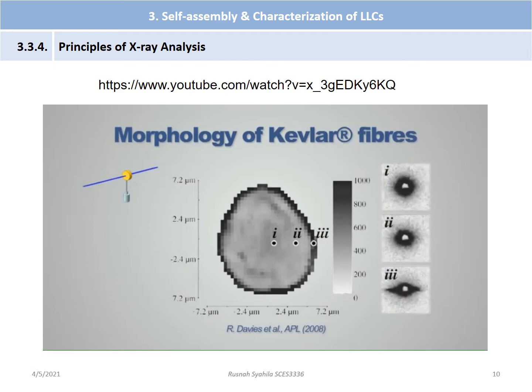Looking more closely at single scattering images, for example at point 1 in the center, you see an isotropic scattering pattern which is indicative of a random orientation. Whereas in the skin you see an oriented image in figure 3 which indicates the orientation.